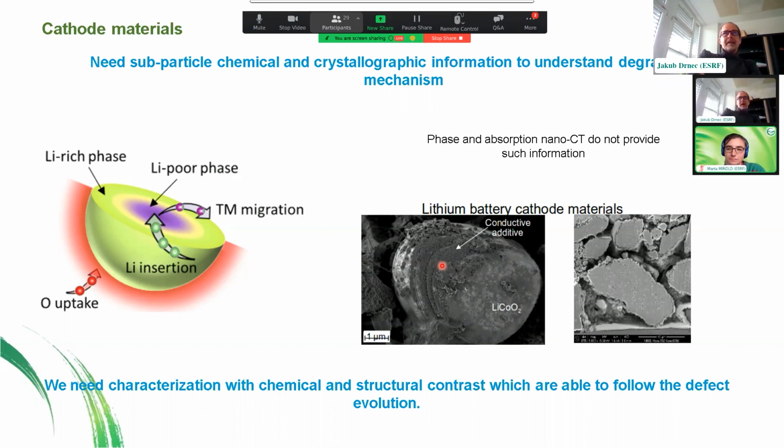So ideally, what you want to do if you have, let's say, a micron-size crystallite of cathode material, is fully lithiate it and fully delithiate it when you want. But this is very difficult, because now you're limited by certain phenomena inside the actual crystallite. For example, defects can hinder the diffusion of lithium inside the crystallite. And of course, if that happens, then you will never be able to use the full volume of the particle.